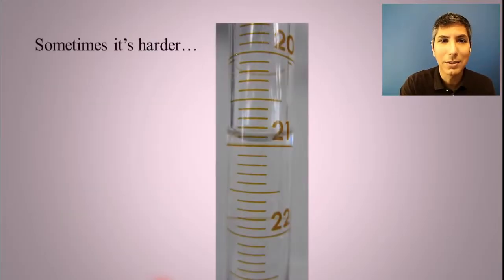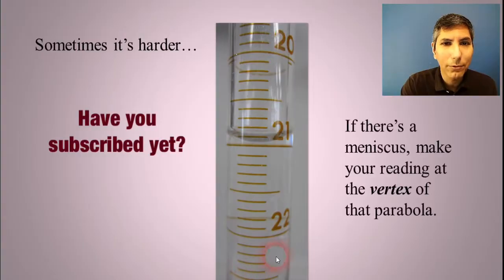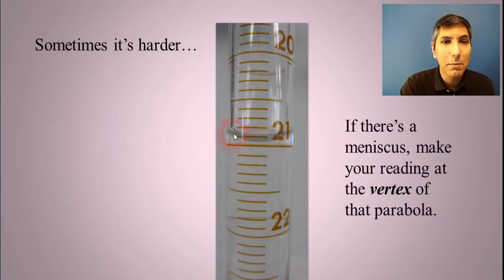However, sometimes it's harder. You may not have a digital readout all the time. You may have something like this burette where you have to estimate. In this case, we have a meniscus. And so in this case, since it curves downward, we read at the bottom of that meniscus.